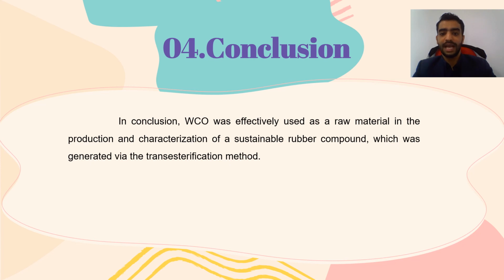After careful analysis of the overall experimental data findings, it can be concluded that raw material characterization such as hardness analysis and tensile properties was helpful to identify the behavior of raw material before conducting the experimental procedures. Using FTIR analysis, the presence of hydroxyl group in rubber compound was analyzed and confirmed using FTIR spectra.